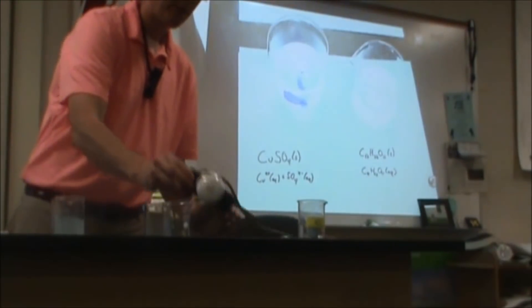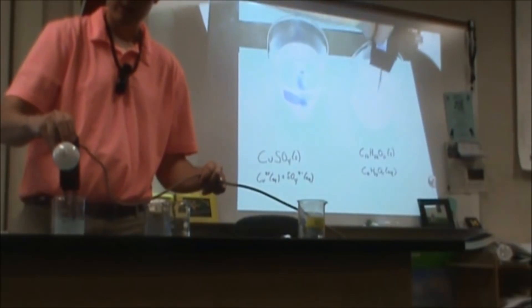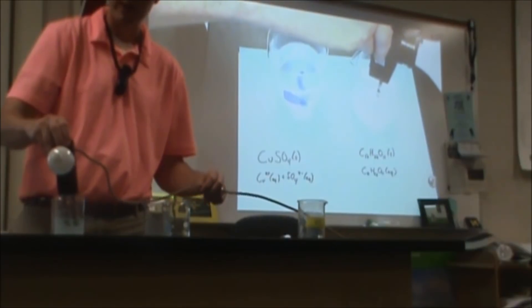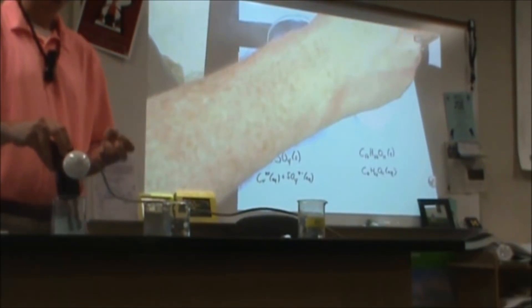When I take this conductivity detector, what we'll see is that for this, nothing will happen. Even if I stir and swing that up, I'm not seeing any light bulb light up, because I don't have charged particles. I just have molecules.